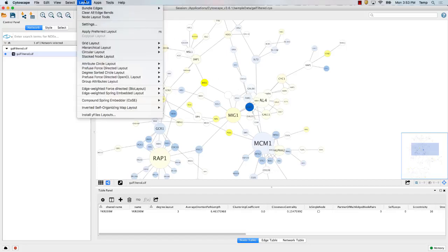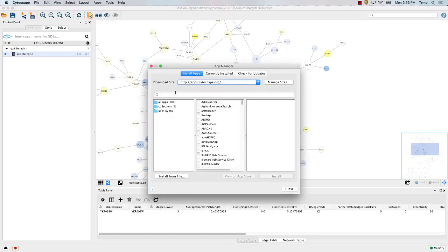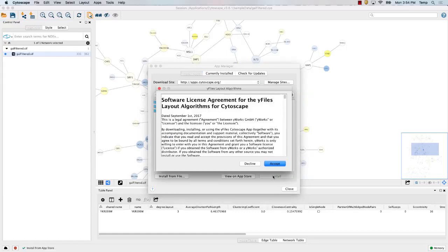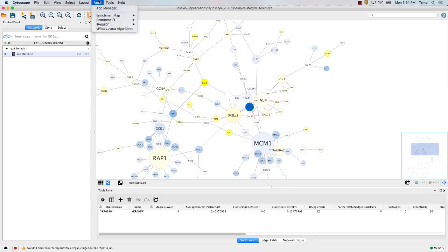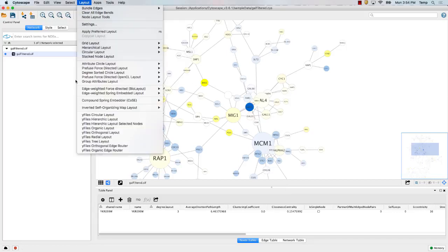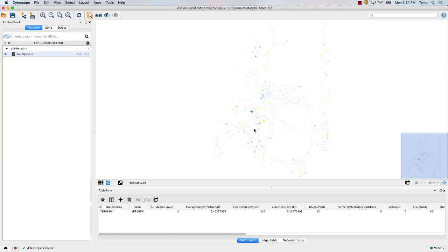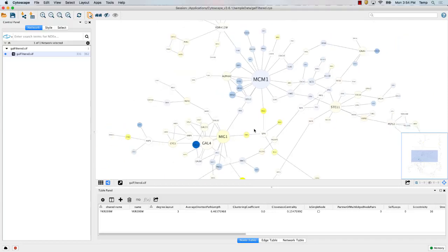I'm going to install the Y-files app — that's Y-F-I-L-E-S — which has some nice layouts. Now under Layout I have a bunch of additional options. One I like is Y-files Organic, which works pretty similarly to the other one but is nice with some additional layouts. One thing you might notice when using Cytoscape is that the labels are disappearing — that's because Cytoscape tries to speed up drawing of networks by removing labels when they're too small to read anyway.